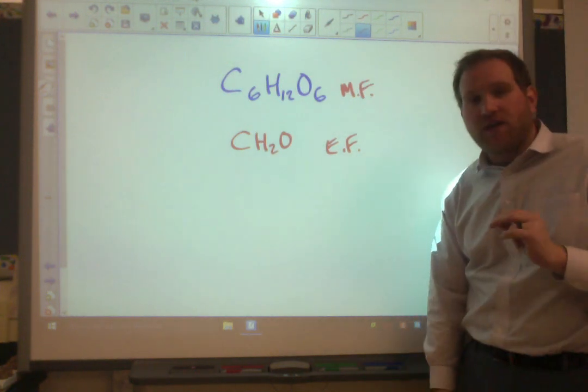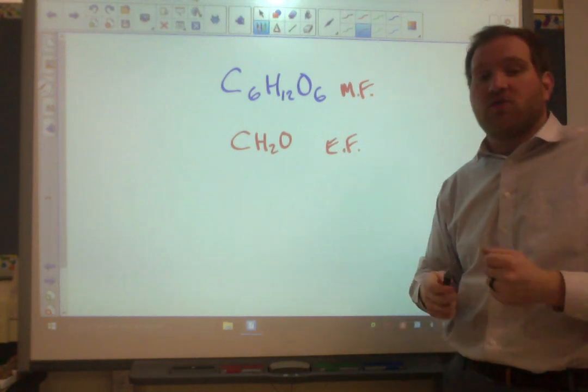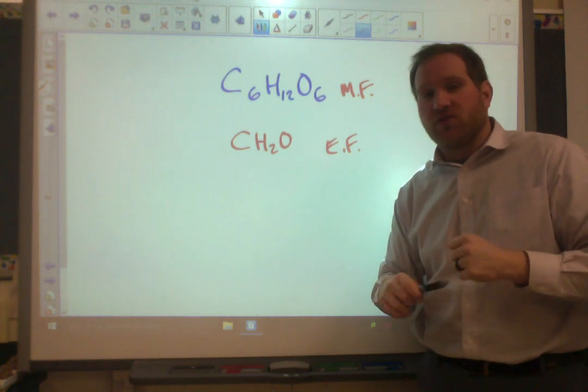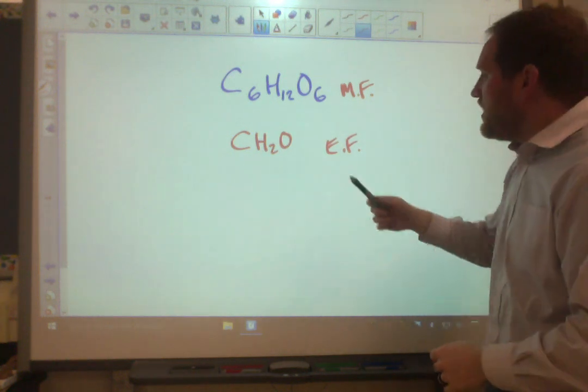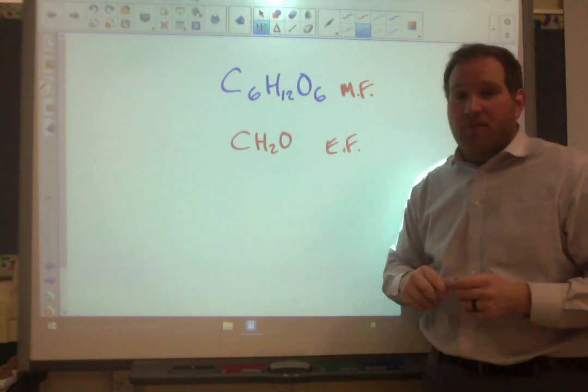So what we're trying to do today is find not the molecular formula, because of course molecular refers to covalent, and when you bond magnesium and oxygen it's going to be ionic, so you're actually not creating molecules. We're going to be finding an empirical formula. Let's review how we do that.